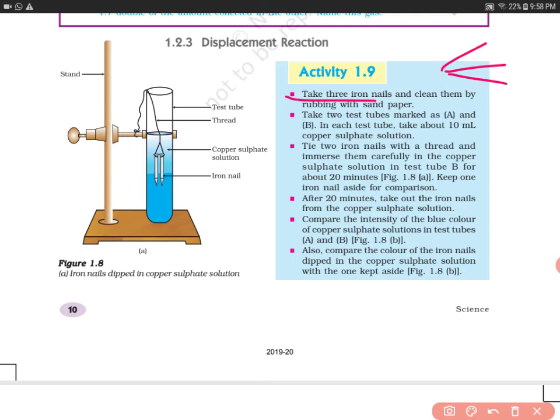It is important to clean the iron nails because iron gets rust easily when it is exposed to air and moisture. You are supposed to clean the iron nail with the help of sandpaper by rubbing the sandpaper on it.